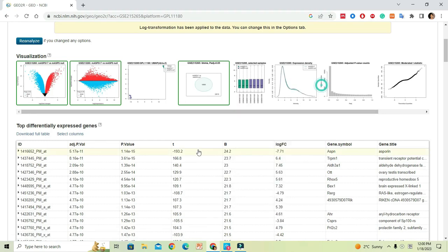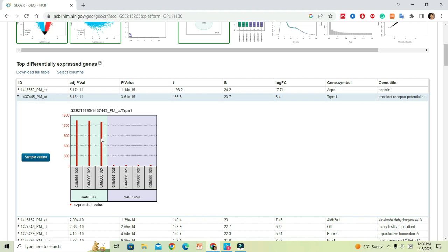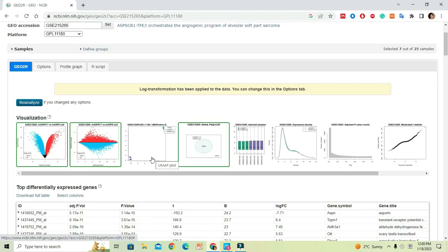Down here, you will get a list of significantly expressed genes. If you click on each gene ID link, that will show the expression values of a particular gene. In this case, TRPM1 — referring to each sample — is highly expressed in the MASP17 treatment group, and it is significantly less expressed in the MASP null group. Likewise, you can investigate any gene that you are interested in for your analysis.